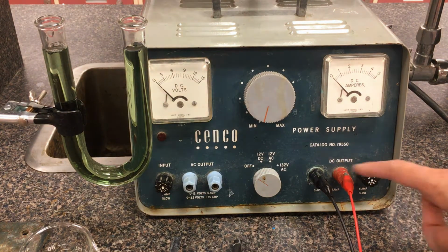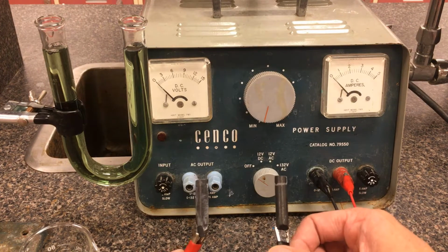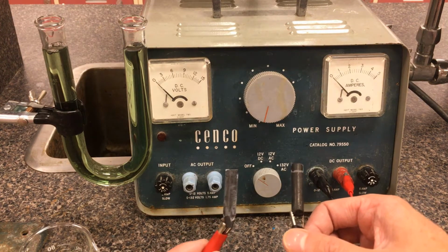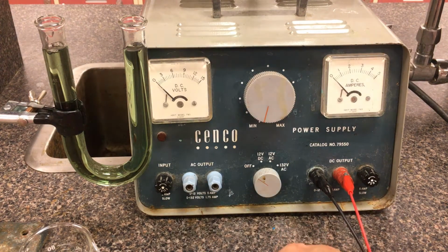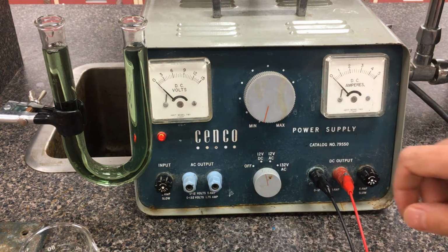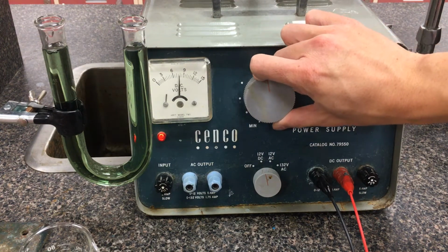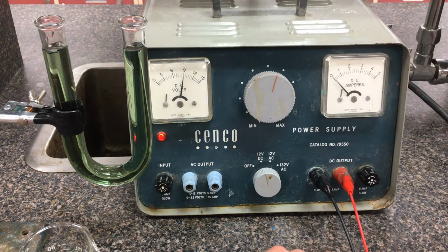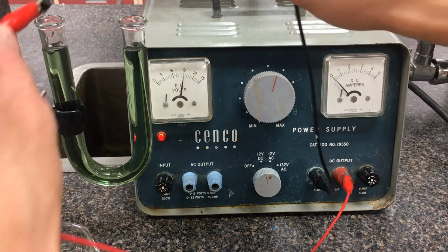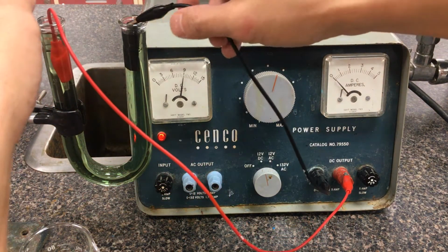For the positive and negative ends of this power supply, both alligator clips are currently holding onto a carbon graphite electrode, and we're going to make some observations of what happens at each electrode. Just before I drop these in, I'm going to turn my variable power supply on. I'm going to crank up the voltage so that the voltage across the two leads will be about 9 volts, and then we can just drop these in and make some observations. So here's the red lead and there's the black one.